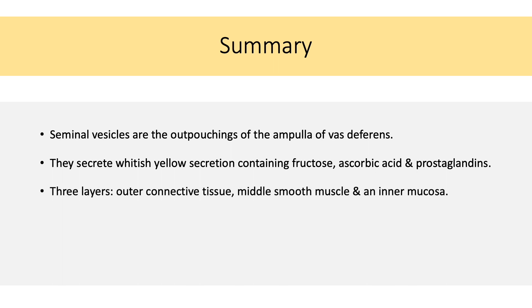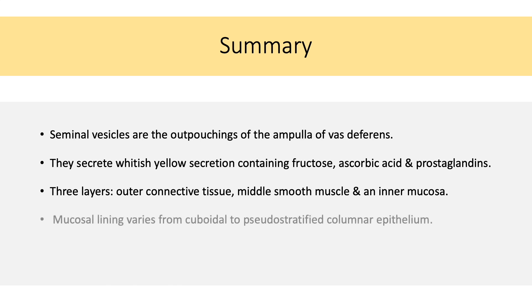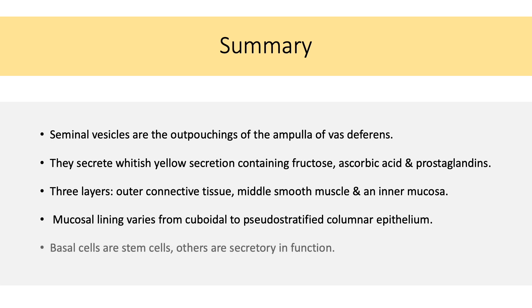We see three layers in its wall: an outer connective tissue layer, a middle smooth muscle layer, and an inner mucosa. The mucosal lining varies from cuboidal to pseudostratified columnar epithelium. Basal cells are stem cells, whereas the other cells are secretory in function.